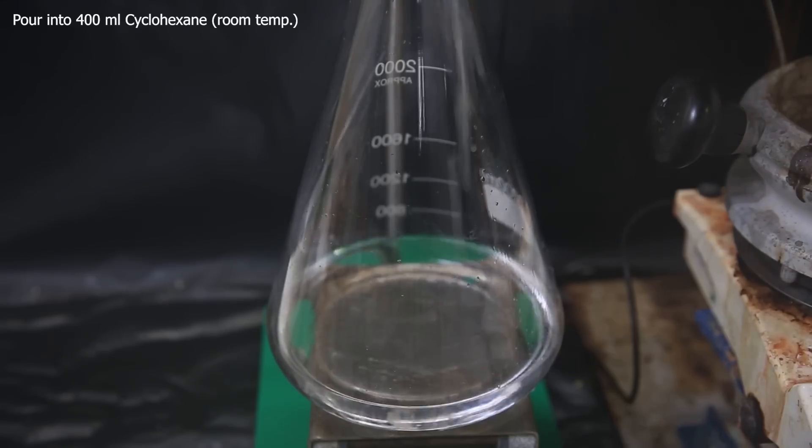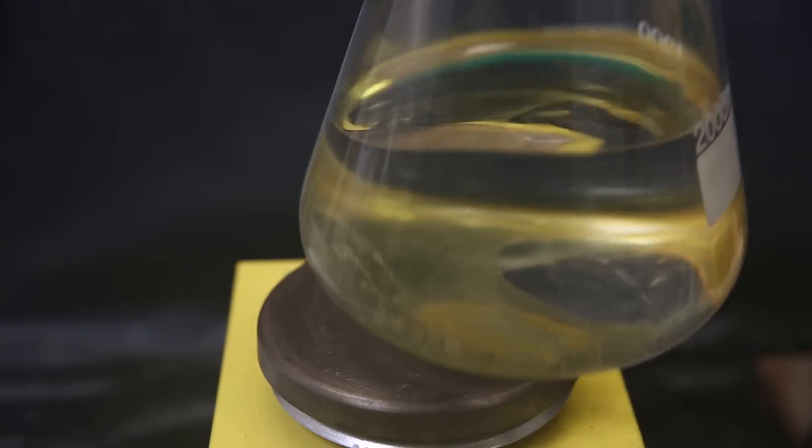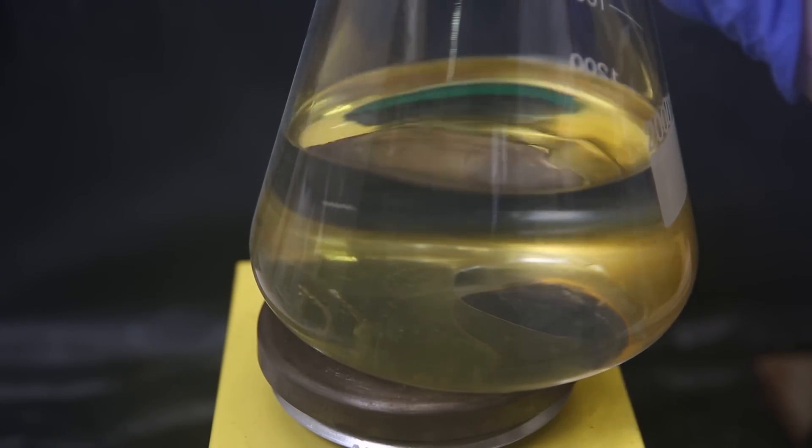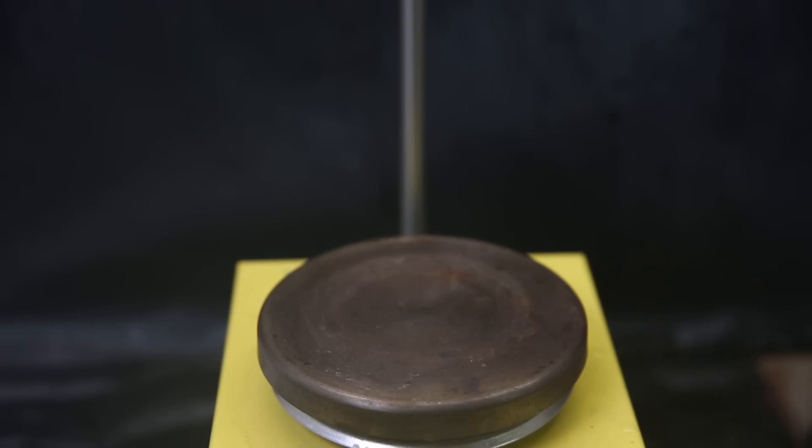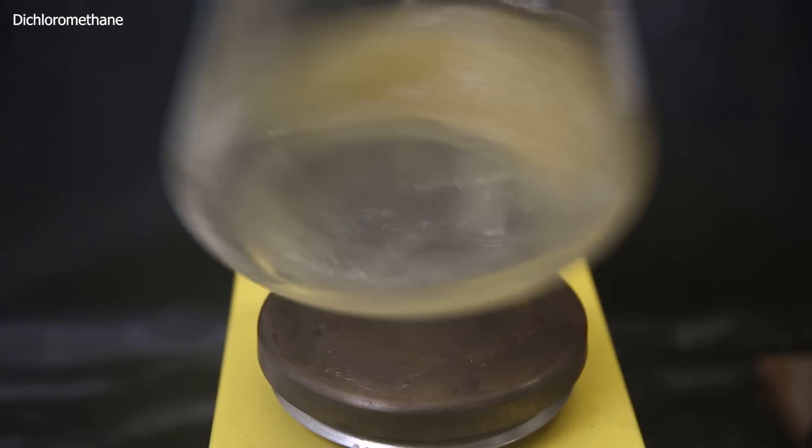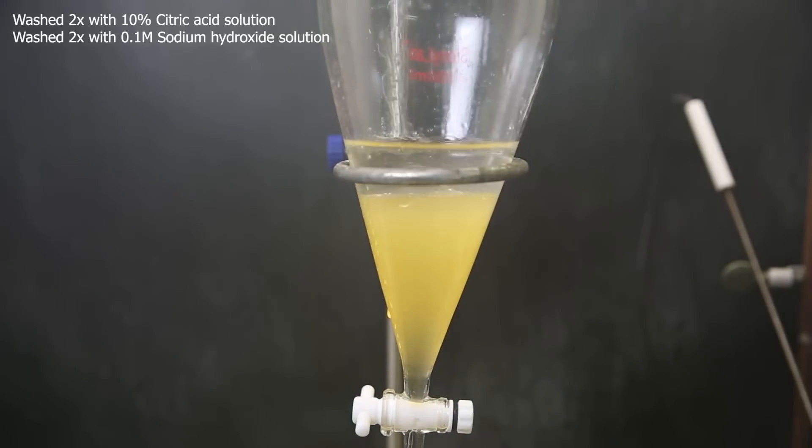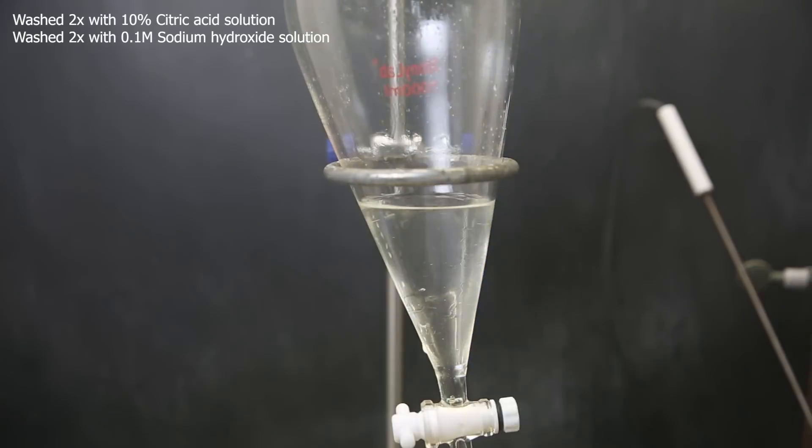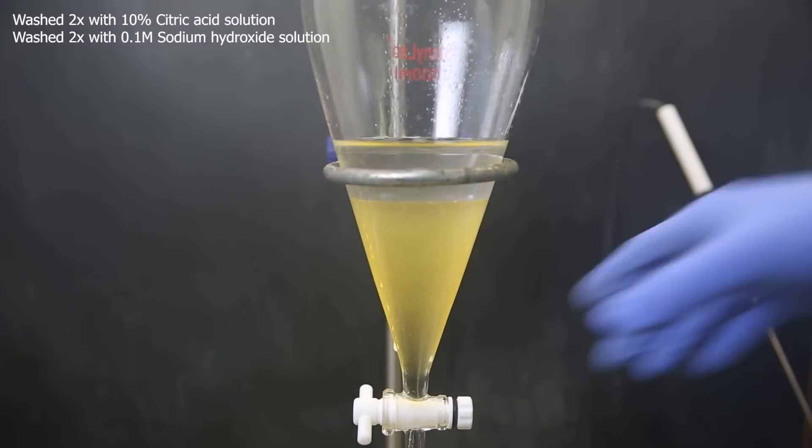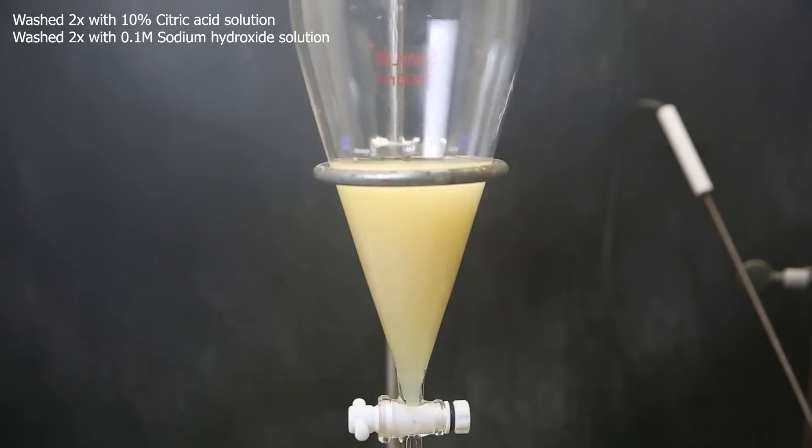Then to precipitate the product, I pour it into 400 mls of cyclohexane and it immediately becomes cloudy. And then allowed it to settle, but it's settled as an oil and not a solid, for which the literature calls for some extra workup. So I discarded all of the solvent and then dissolved the remaining oil in some dichloromethane. I move this solution to a separatory funnel and wash it twice with a 10% citric acid solution and then twice with a 0.1 molar sodium hydroxide solution, which in literature is said to fix this problem.